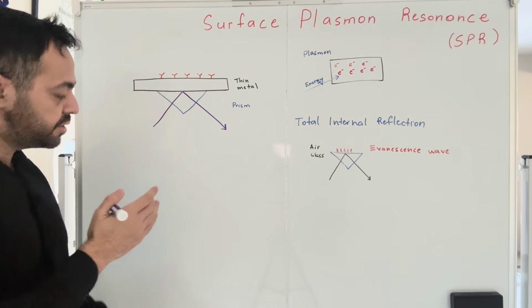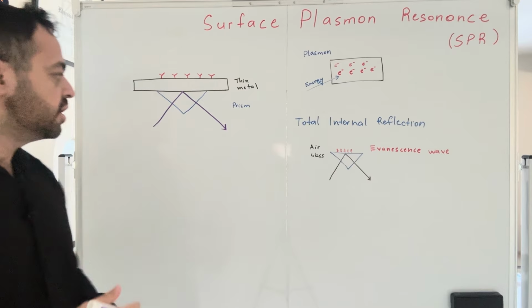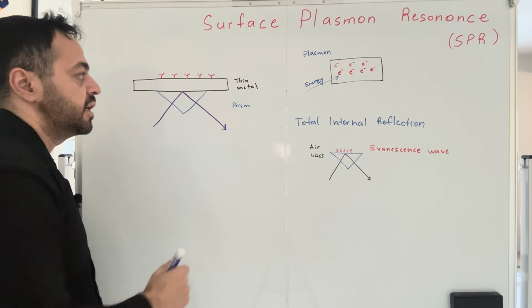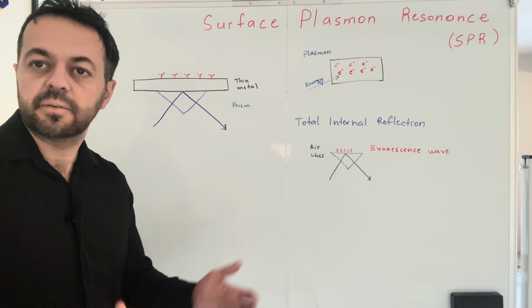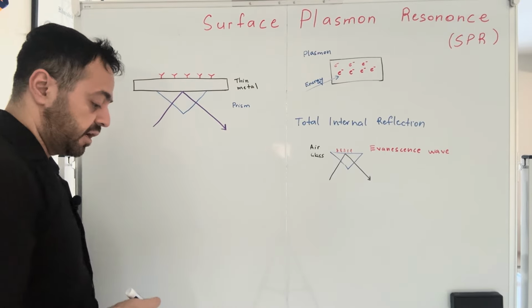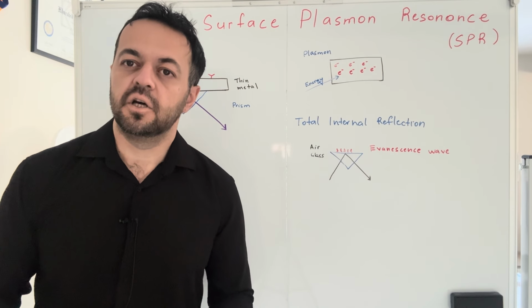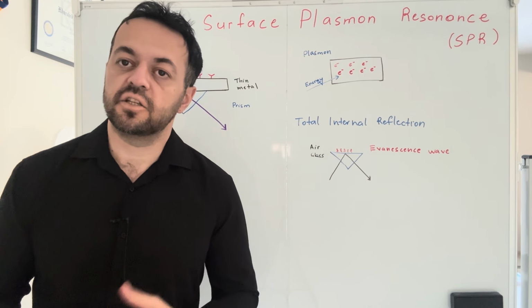So now what we do, we shoot the light, the electromagnetic radiation, and then it internally reflects, it totally reflects the light, and then what happens, it generates this evanescent field. So this is the typical mechanism. And on the other side here, now we can immobilize our biological sample. Typically, they immobilize the antibody, for example, to observe the antibody-analyte or antibody-antigen interaction.